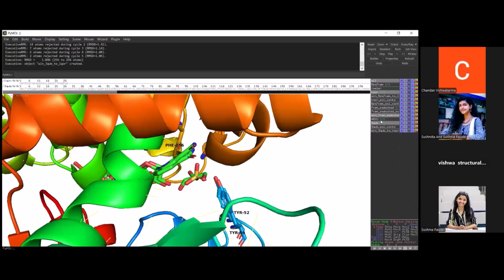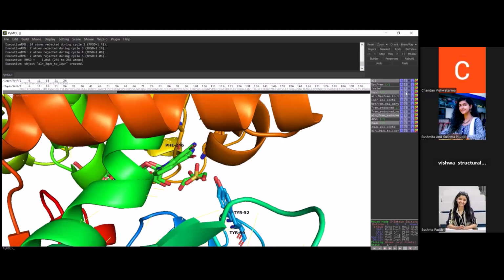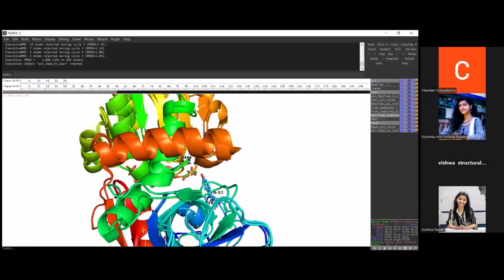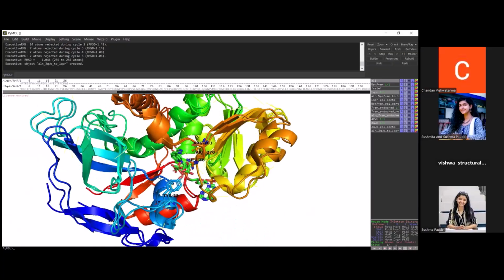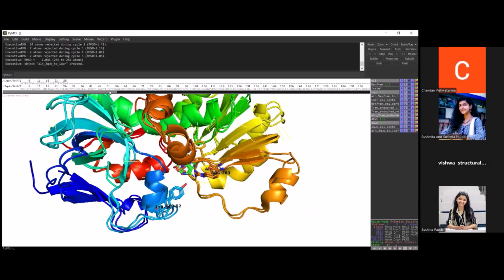Maybe show it as cartoon. And which one? 1QR. This one, so it's cartoon. Okay, I've done this. Now just do the command once again. Let's see why that is happening. Now I'll tell you, this has very low identity. See, this one has NADPH here and glycerol here. That's why it's not aligning this way.